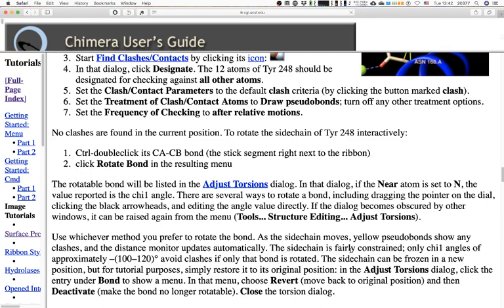The side chain is fairly constrained: only chi-1 angles of approximately minus 100 to minus 120 avoid clashes if only that bond is rotated. If we were to rotate more bonds at once, different parameters would emerge. The side chain can be frozen in a new position, but for tutorial purposes simply restore it to its original position. In the Adjust Torsion dialog, click the entry under 'bond' to show a menu, then click 'Revert', then 'Deactivate'.